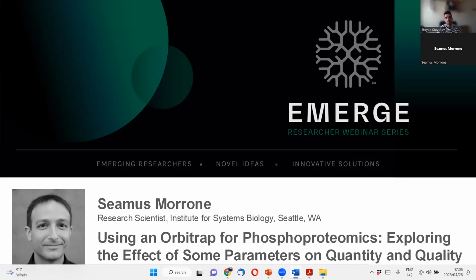But today he's going to focus on some of his work where he systematically characterized the different data acquisition parameters, particularly on Orbitrap systems, but also with different front ends, LCs, and different phosphopeptide enrichment chemistries in order to get the optimal coverage and localization confidence from phosphopeptide enriched samples.